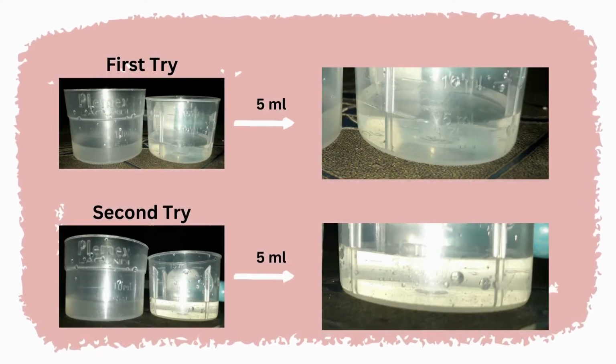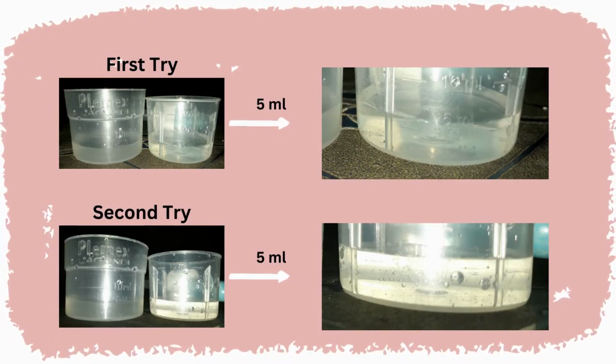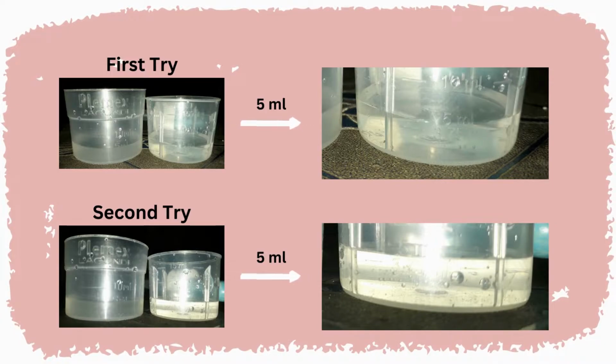Here, you see that I directly estimated 5 ml in just one try, so I repeated, which my second try also estimated 5 ml, so this only took me just one try.